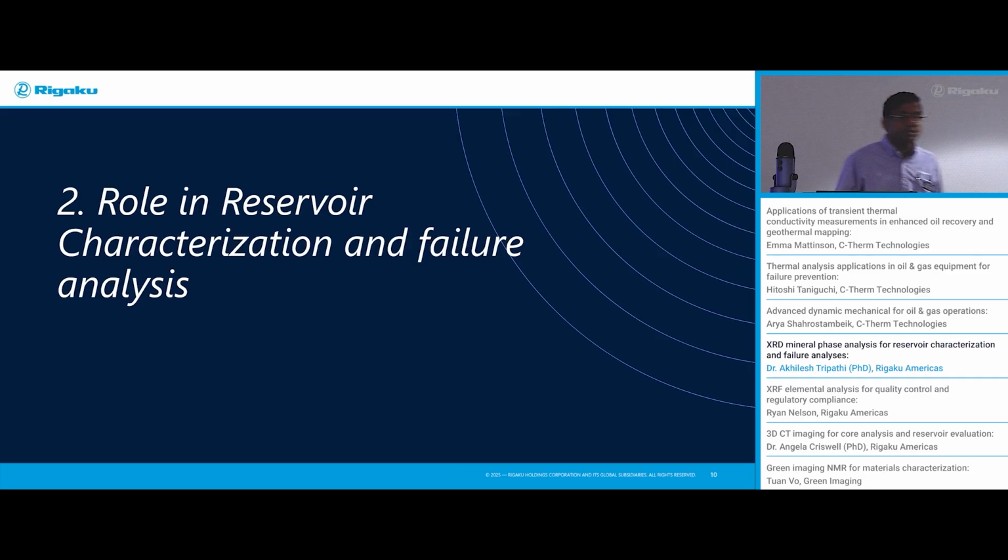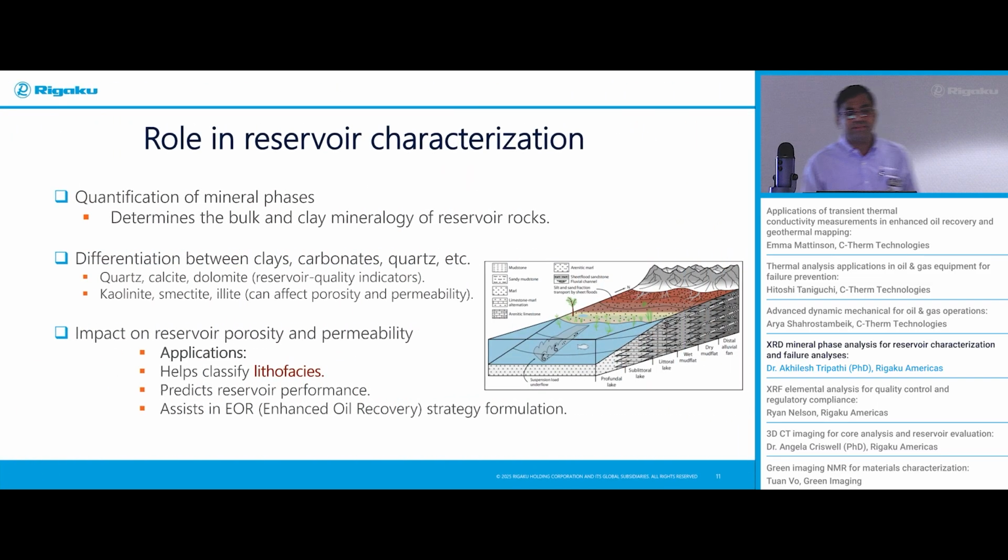Okay, so let's move to the second topic, role in reservoir characterization and failure analysis. So what is reservoir characterization? It's the quantification of mineral phases in a reservoir. We want to find the bulk and clay mineralogy of reservoir rocks. So why do we need that?